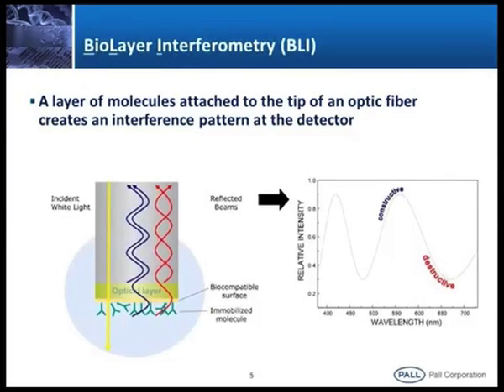Here, due to this biocompatible matrix, there is always a kind of block, and some light gets reflected back. Only 5% of the light gets reflected, and the rest, 95%, is transmitted into the well. One light which goes through the ligand encounters an obstacle due to your ligands, and once again light gets reflected back. Constructive interference makes the signal rise, destructive interference makes the signal drop.